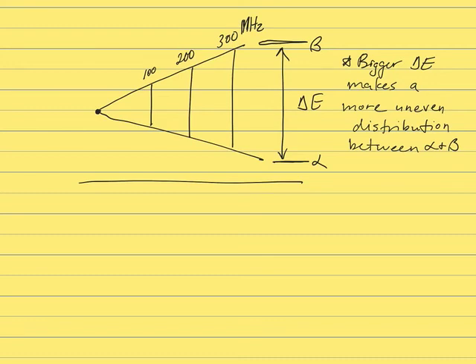So our NMR at Seton Hill is a 60 megahertz instrument, which in terms of NMR spectrometers is not a very strong one. Strong NMR spectrometers, they make ones now that are 500, 600 megahertz. So 60 megahertz isn't that strong, but it still works just fine for a lot of applications. Okay, so I want to explore what this larger distribution does, and the concept of net spin, in order to understand the rest of what happens in NMR spectroscopy.